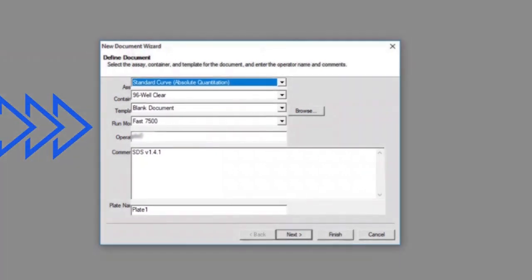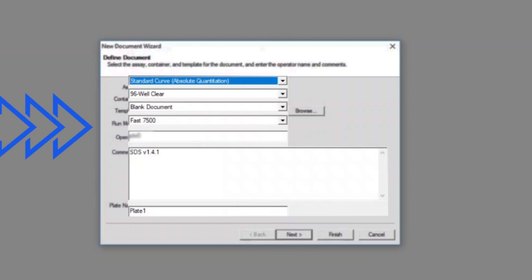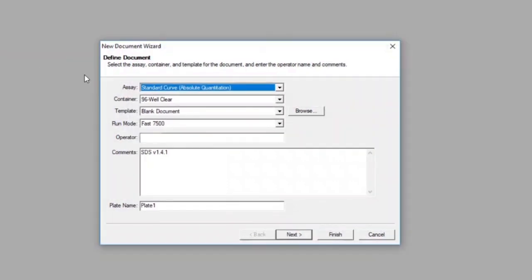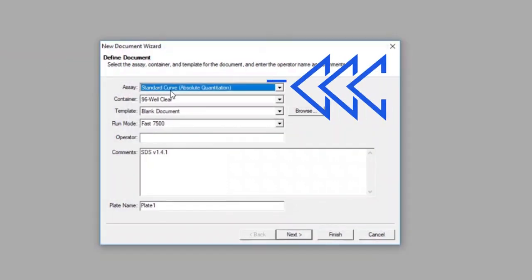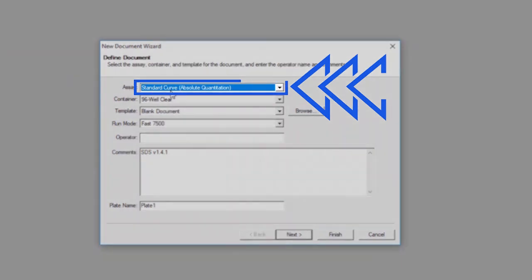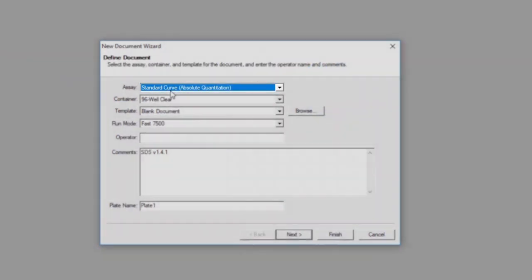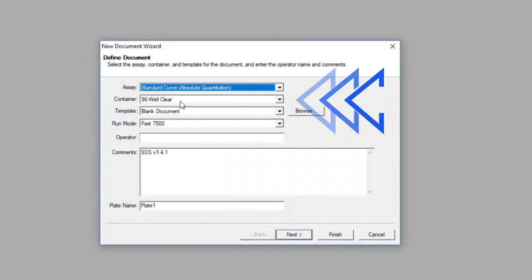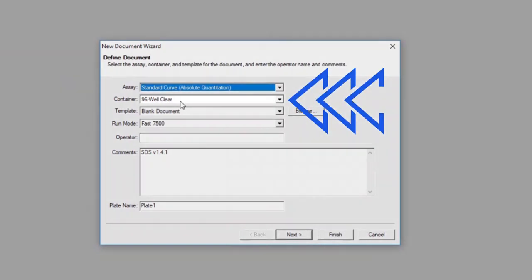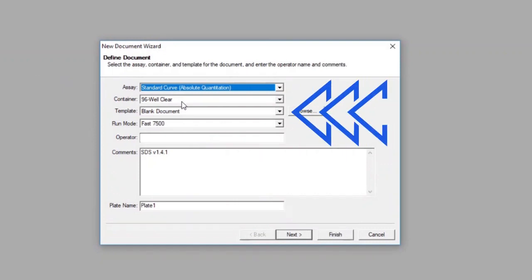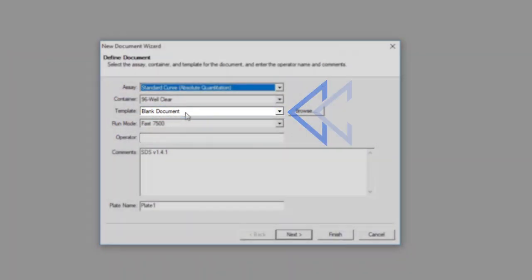On this screen, ensure that the following settings are selected. The Assay setting should be set to Standard Curve or Absolute Quantitation. The Container setting should be set to 96-Well Clear, and for the Template setting, select Blank Document.